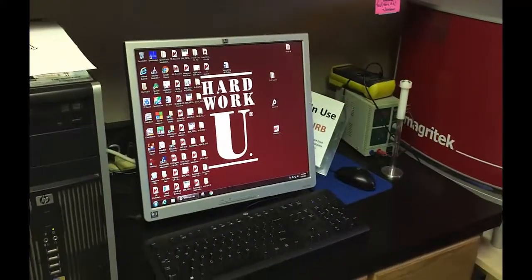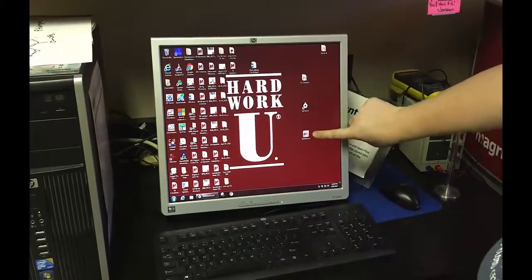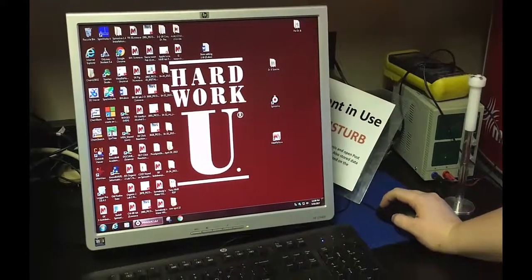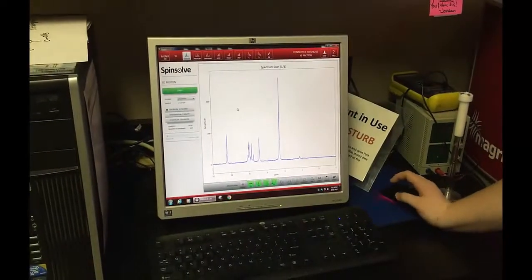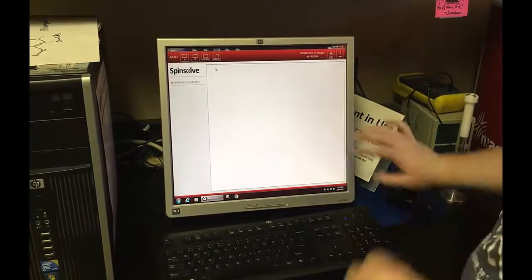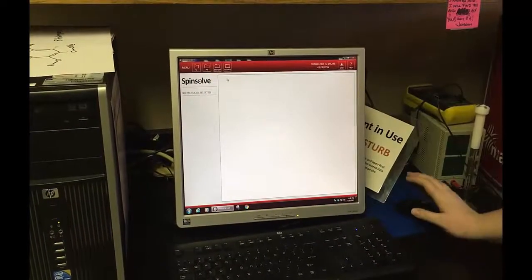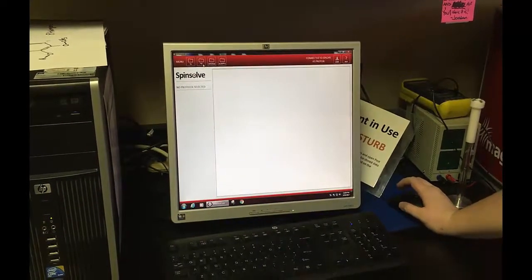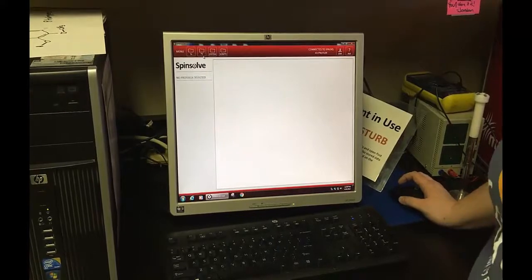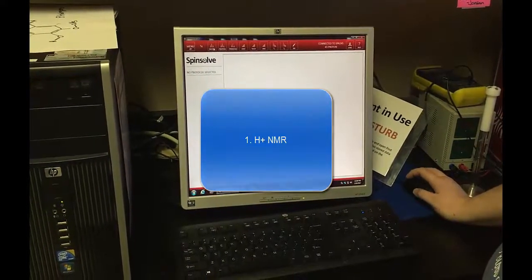Here on the computer, there are two things that you'll use: the SpinSolve software and the MNova software. Today we're going to use the SpinSolve, and this is how you get your data. There are two different kinds of NMR you can run: hydrogen NMR and fluorine NMR. You can only run fluorine NMR on molecules that have fluorine in them. Since I don't have any fluorine in vanillin, I'm going to run a hydrogen NMR, a proton NMR.